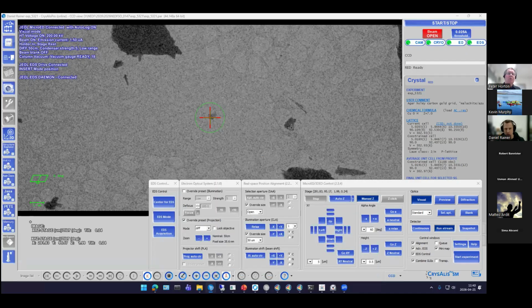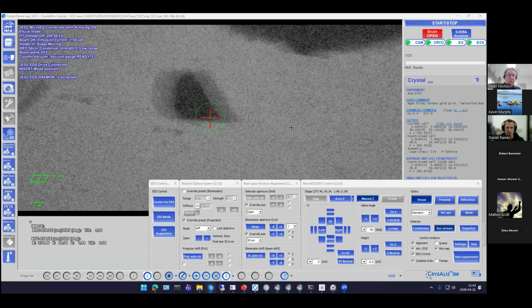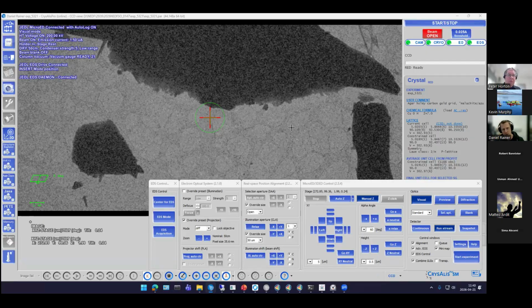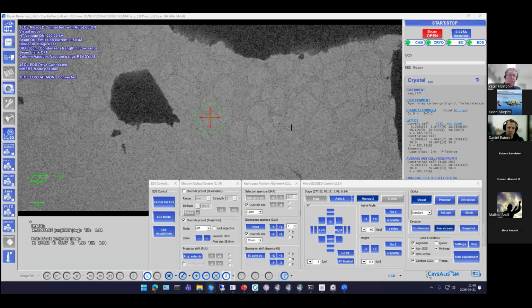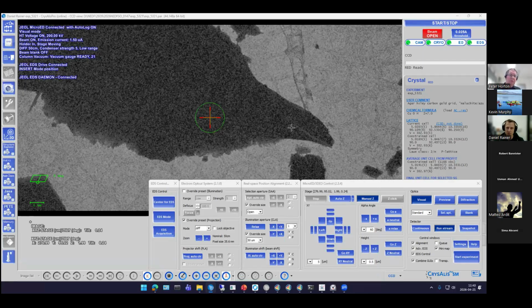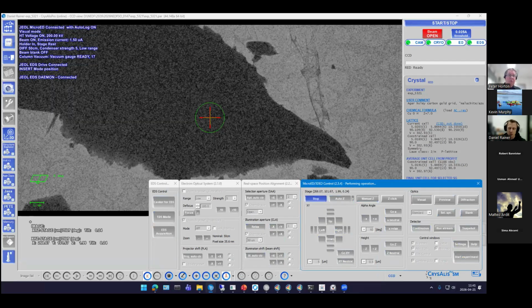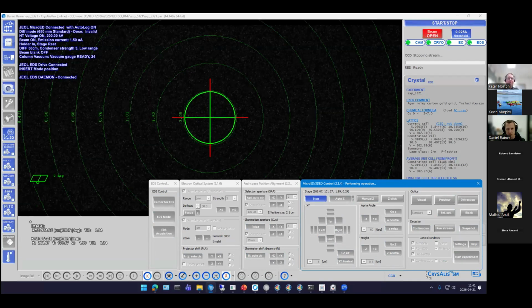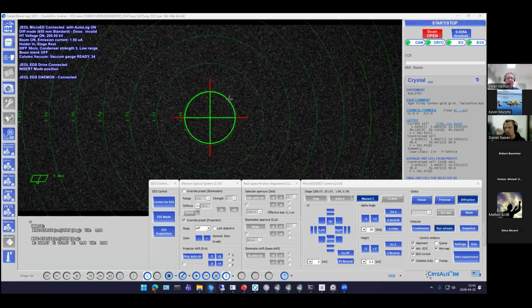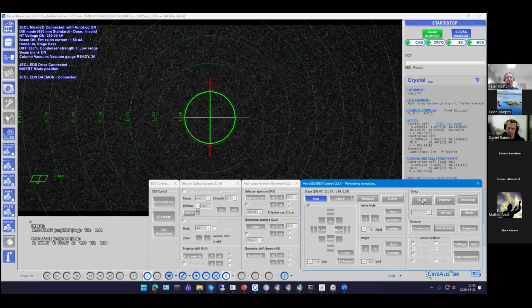And now this is then what it looks like. So one can move around this grid, right? Here's a large particle, there's a smaller and even larger one, possibly agglomerate, and so forth. And just to demonstrate what I meant before with when the particle is too large, I just maybe go to this one here. We're currently in this visual mode, if I switch to diffraction mode, it takes a second to switch over. We don't see anything, right? And this is not because there's nothing, it's because the sample is so thick that nothing reaches the detector anymore.